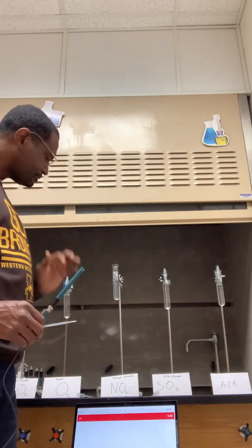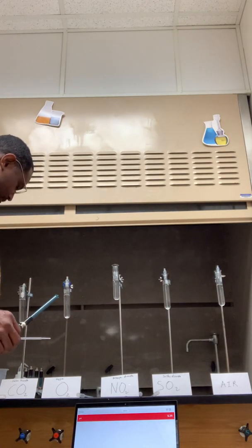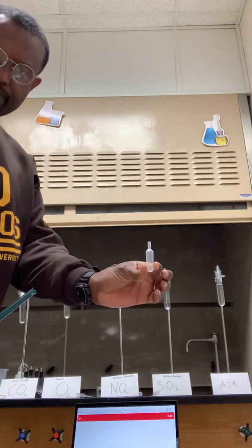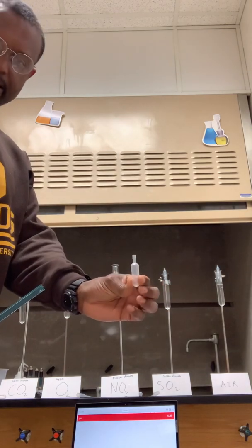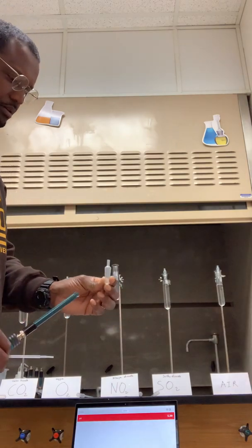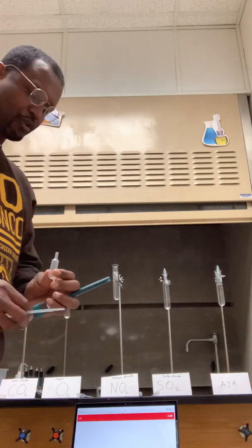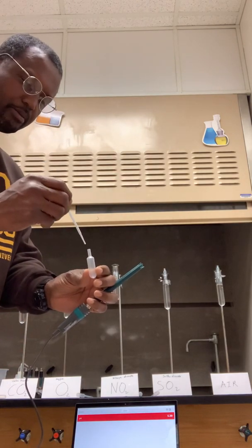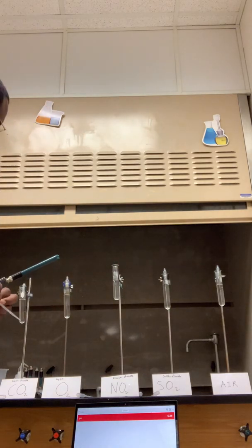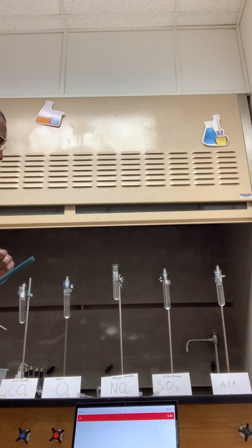And so we make the gas by reacting those reagents in a gas generator. The gas generator is no more than just a cutoff, short stem pipette, and in here we put those reagents. After the reactions have been performed, we extract some of the gas from each gas generator, and we try to dissolve the gases in distilled water.